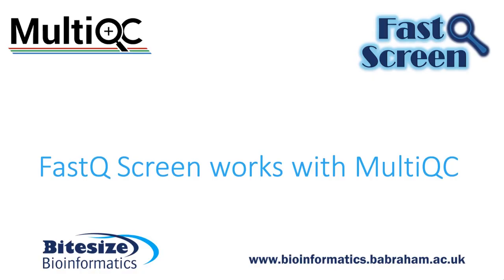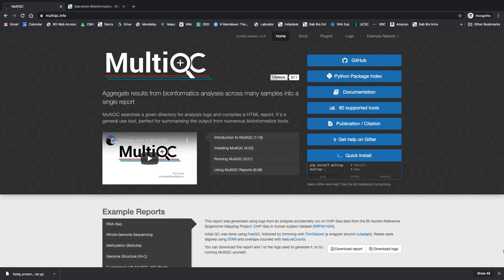It is also worth mentioning at this point that FastQ Screen is compatible with the tool MultiQC. MultiQC was developed by Phil Ewels, who was formerly at the Babraham Institute. What this tool does is allow you to aggregate lots of different forms of analyses from bioinformatics tools and pipelines into a consolidated single report. A FastQ Screen module was incorporated into MultiQC from the beginning, and as such provides an excellent way to compare a large number of samples. So let me show you an example.